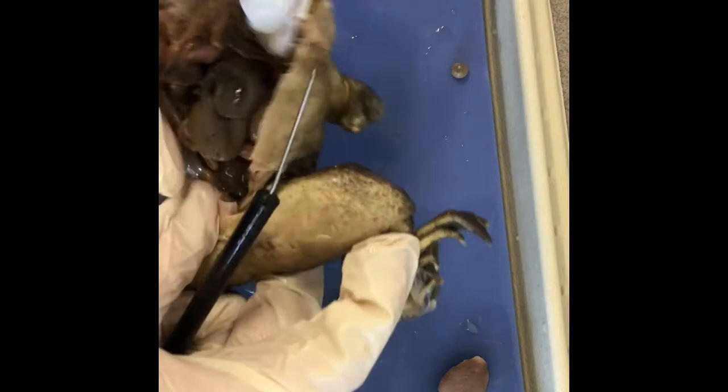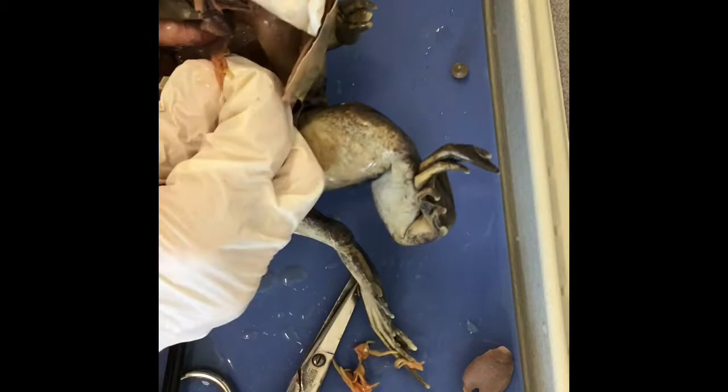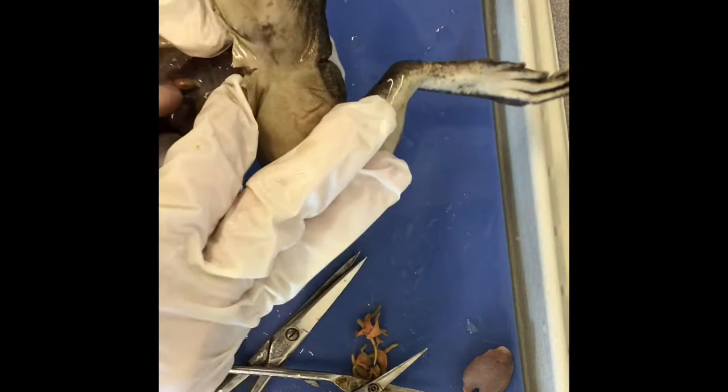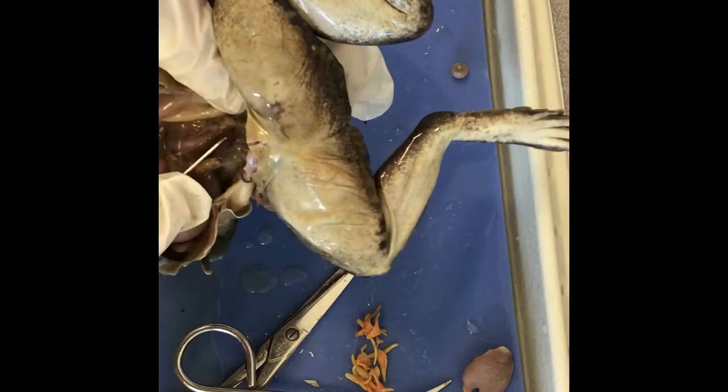These down here are fat bodies — this frog doesn't have a ton of them, but these are fat bodies. I'm going to take out a few of these things. This pouch down there is the bladder. You have the kidney, which is dark — this reddish dark thing right here.